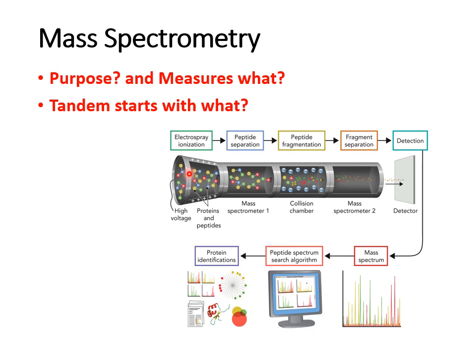And what that basically is, is high voltage that is applied to a liquid to create an aerosol. And aerosols, most students know now, thanks to the pandemic, what an aerosol is. But basically, you end up with this spray of ions that can then run through the rest of the machine, and you end up having these spectrum analyses that are possible to identify the protein based on mass.